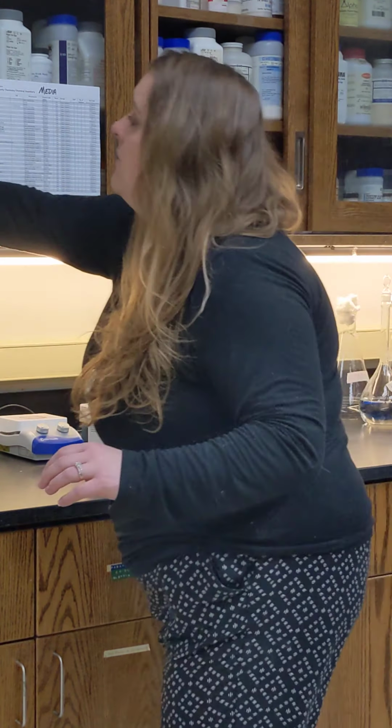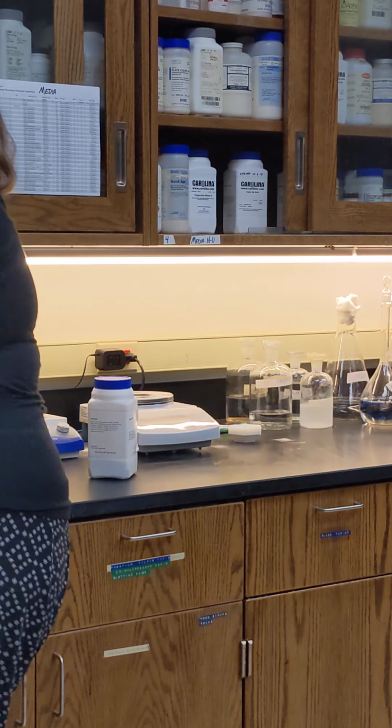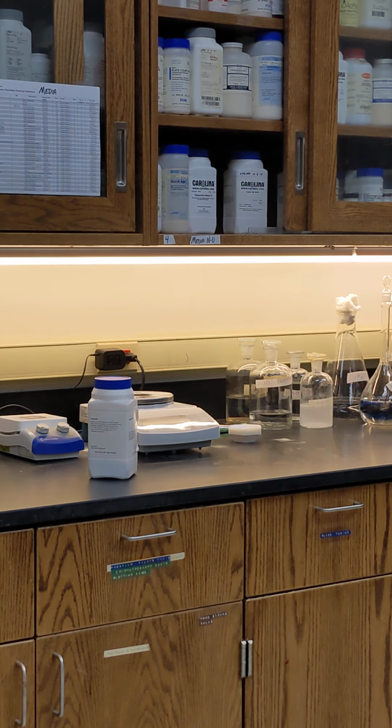The agar itself, if you're curious, if you're making it from broth, you would just add the correct amount, usually 1 to 2% of agar. If you've ever made a jello or anything like that, you've done something quite similar at home, and you probably know a little bit about this procedure.